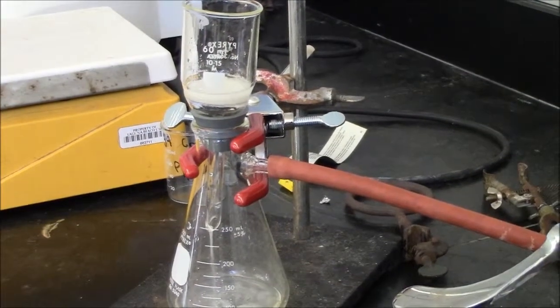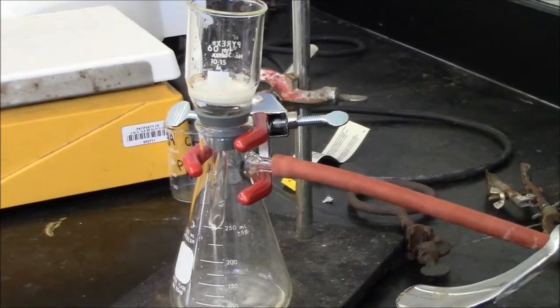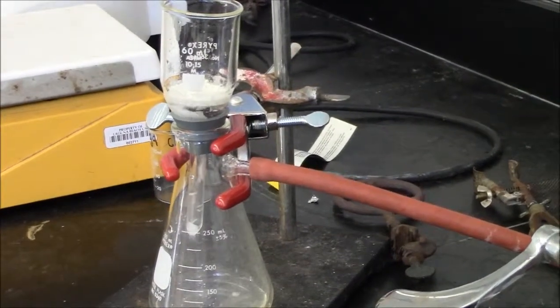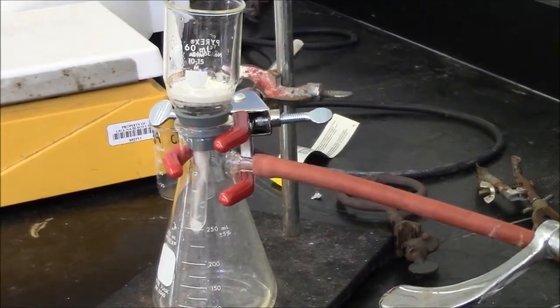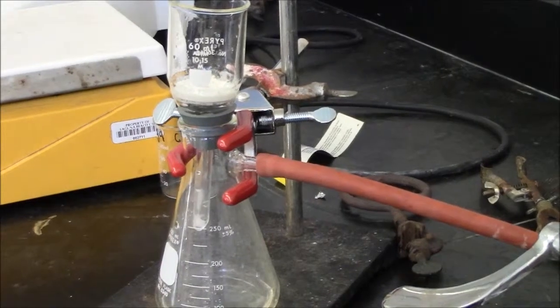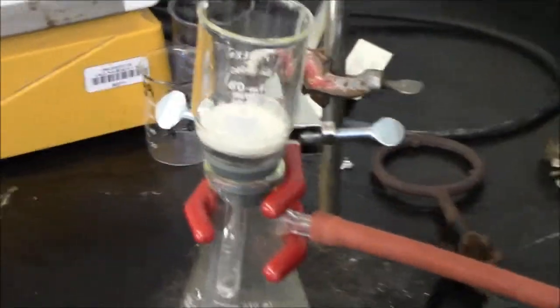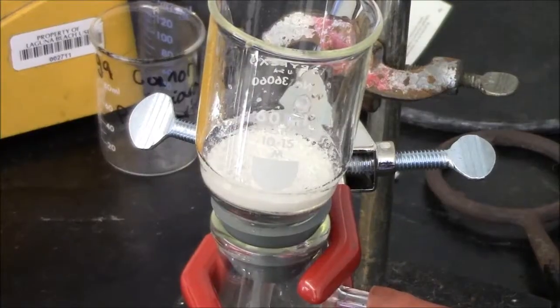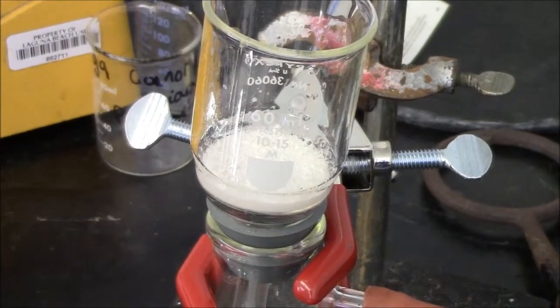It'll start drawing air through the frit. Here you can see that it's pulling air through the frit now. And so that will dry your crystals similar to blowing nitrogen over them. In the end, you should have your crystals on top in a fairly dry state and you'll need to scrape them out with some spatula.